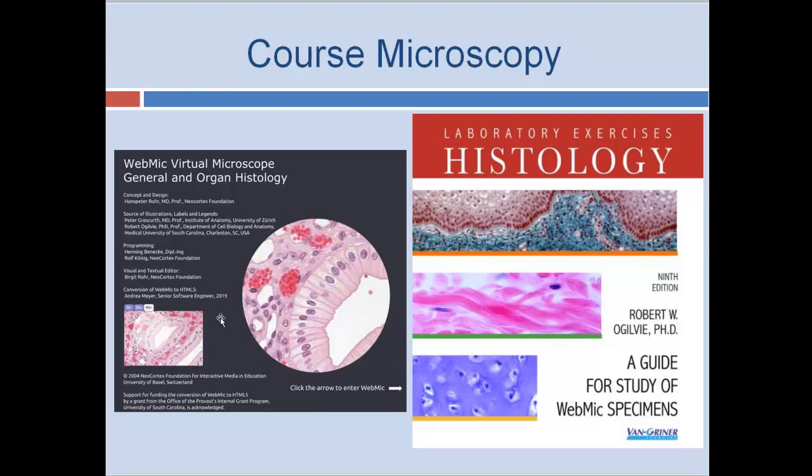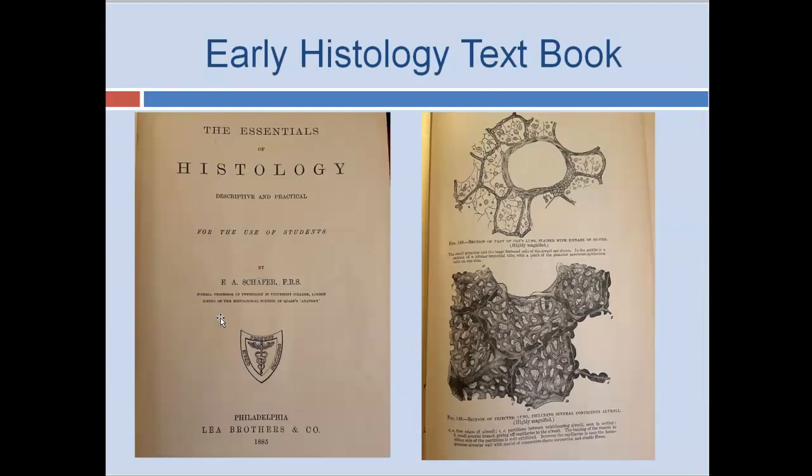So you're going to use WebMic in combination with the laboratory exercises of histology, a guide for the study of WebMic specimens that I am the author of, and that is now an electronic book with interactive questions and the ability to take notes and create flashcards. And one of the most helpful additions, according to students, is that I have created 150 very short 1 to 6 minute videos that give you a tour of each of the WebMic specimens you're assigned to study.